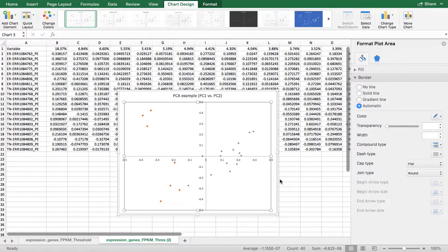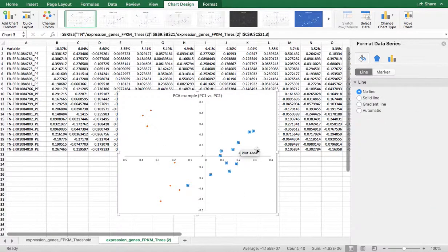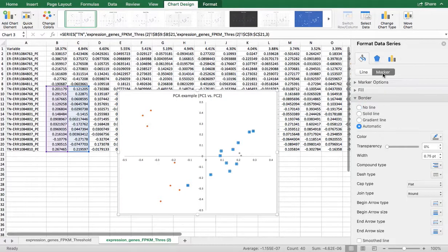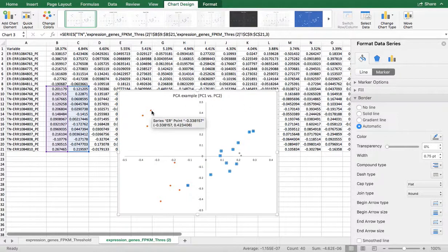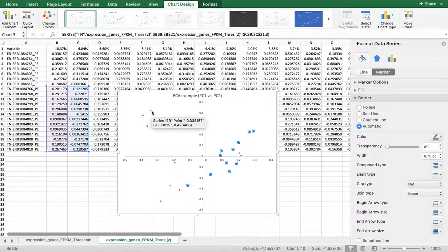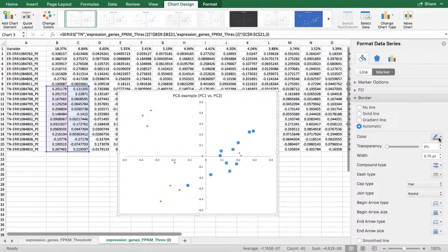Now I have this nice separation. Once you've worked with this a little bit, you're going to see that there's a lot of things that you can do. And because you can do it, it's sometimes nice to do it. Let's do this.